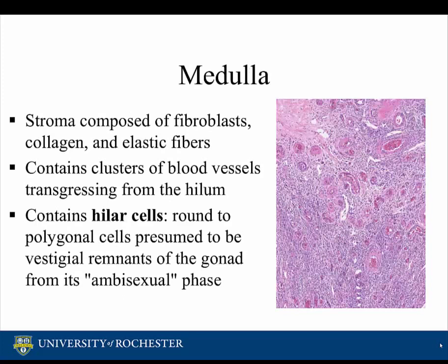The medulla of the ovary has a stroma composed of fibroblasts, collagen, and elastic fibers. It also contains clusters of blood vessels transgressing from the hilum. The medulla also consists of hilus cells, which are round to polygonal cells presumed to be vestigial remnants of the gonad from its ambisexual phase.